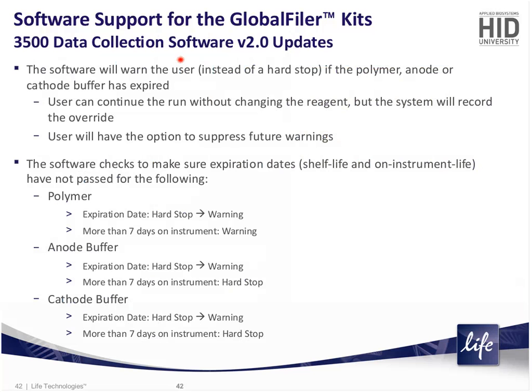Now, you do not require data collection software version 2 to run the GlobalFiler Kit data. You can run it perfectly happily with the version 1 software that was installed with your instrument originally. However, we have updated certain things about the software, including some of the GlobalFiler specific assay templates, etc., within the data collection software version 2. So there are some benefits to GlobalFiler users with this software. But of course, it really is the RFID limits that are changing, that we've been asked to make these changes by laboratories wishing to have slightly more flexibility on the platform.